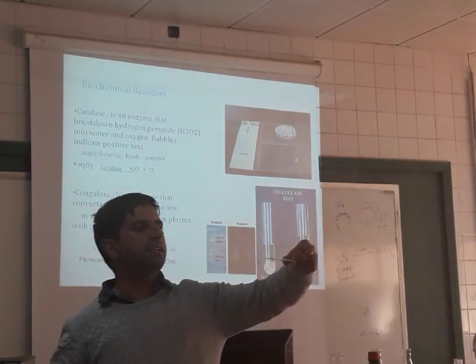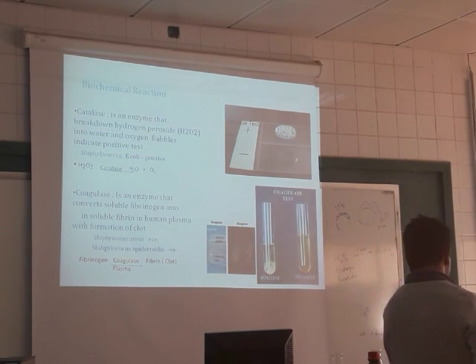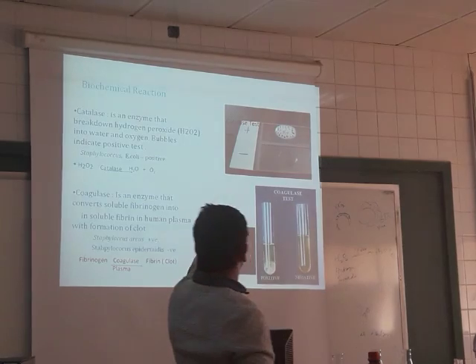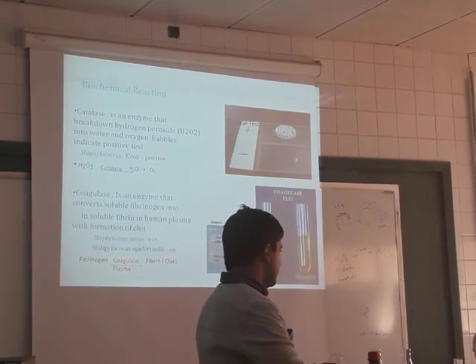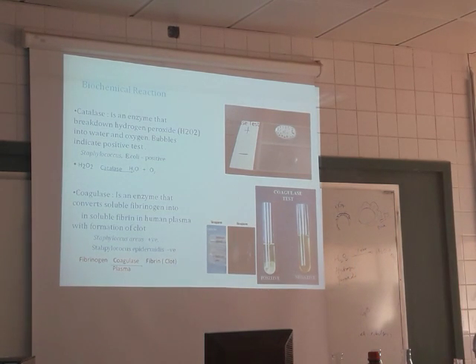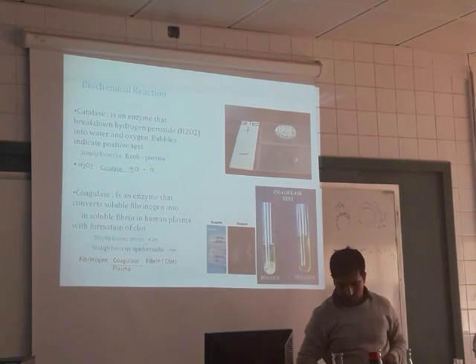This means this bacteria has the capability to break down hydrogen peroxide into water and oxygen. When bacteria do this, it is called catalase positive bacteria, like Staphylococcus and E. coli. They are catalase positive.